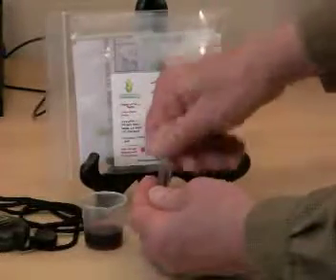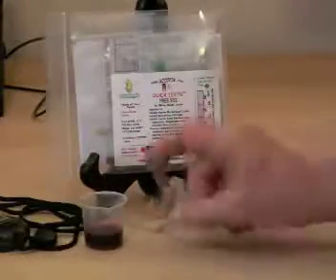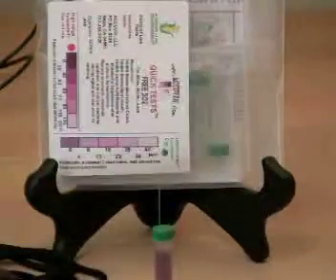We'll replace the green cap, shake a few times, and wait five minutes. We'll start a timer. Five minutes is up.